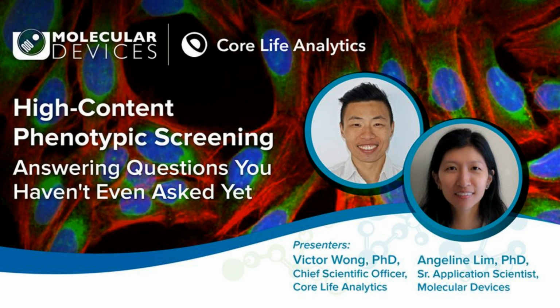So I can talk about the image analysis part of it. I analyze the data on a standard imaging workstation. It's not any supercomputing device that we have for that. So I would say it's got a certain number of cores that you need to run analysis, but I think any typical image analysis workstation will work.